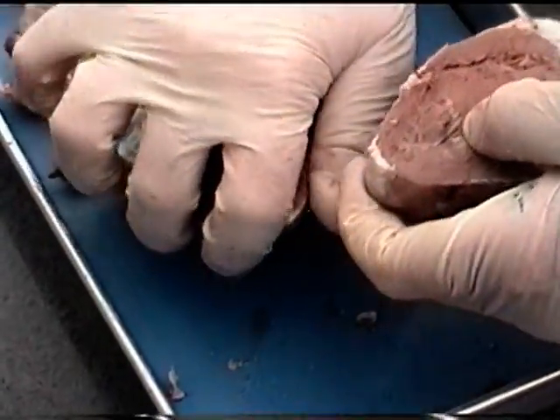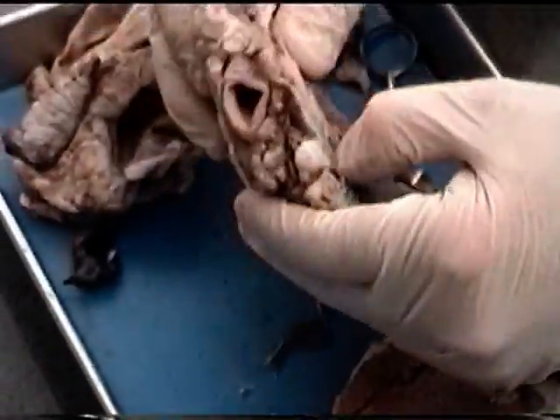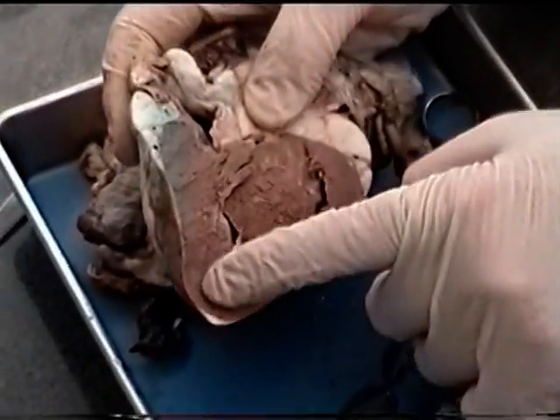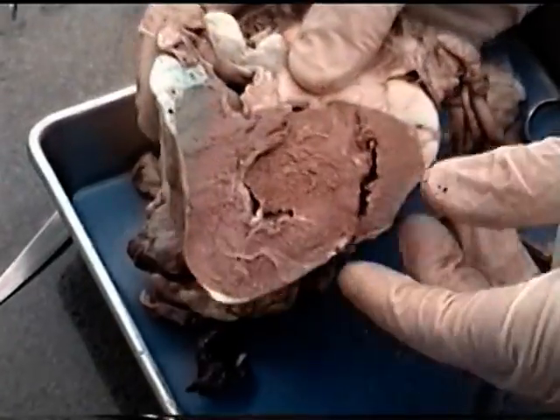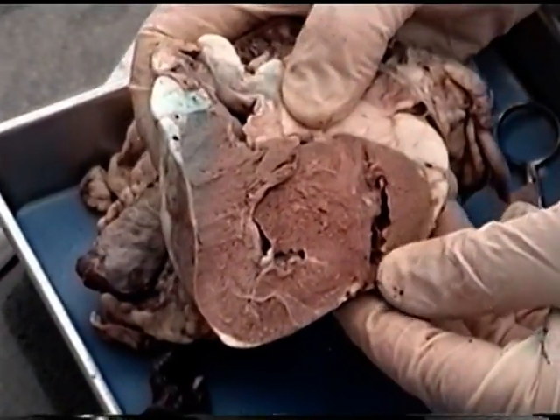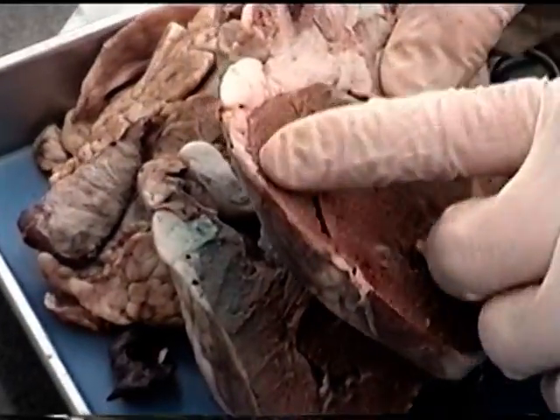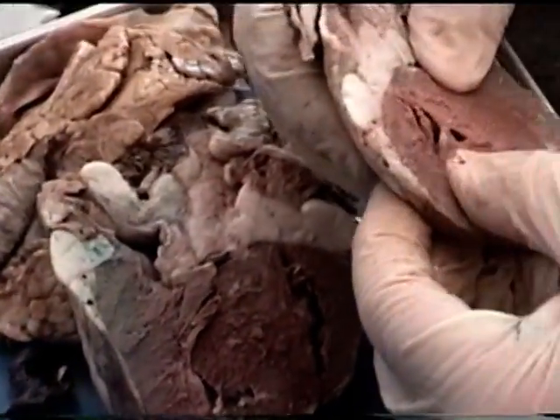Okay, so what we want to do is get an orientation of our heart again. The myocardium is always thickest on the left side of the heart. The myocardium is always thinnest on the right side of the heart. So we can distinguish the right ventricle, this chamber here, because of how thin the heart wall is.